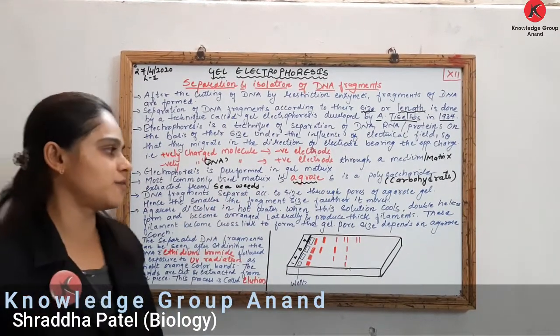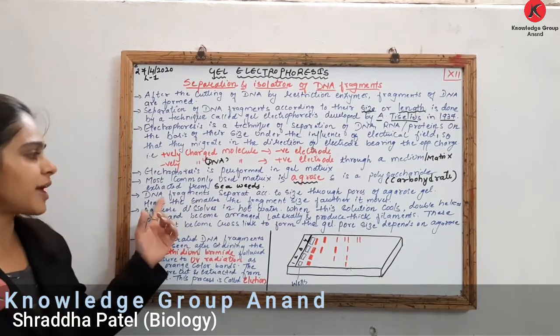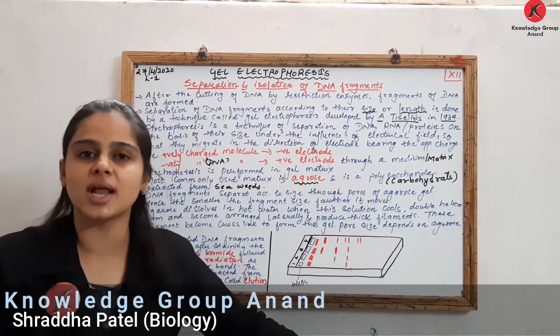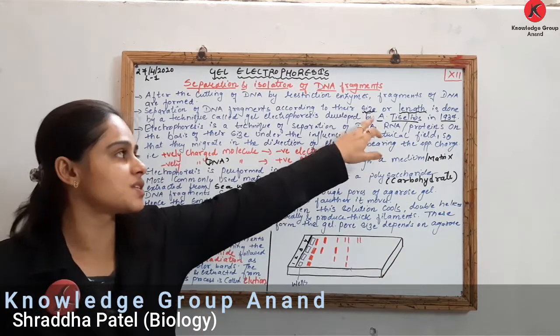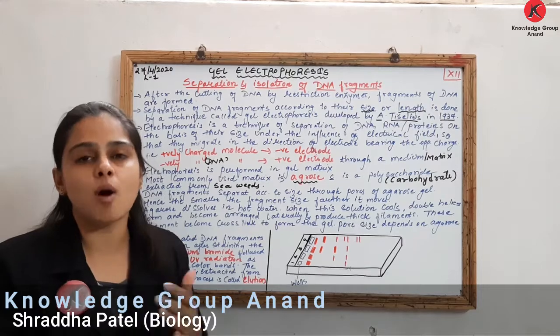So when DNA fragments move through the pores of agarose gel, they are separated on the basis of size or length. Simple thing. Now let's talk about agarose gel.